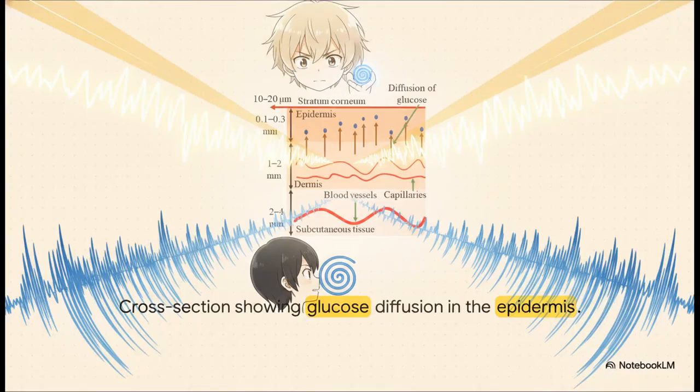This has led to some absolutely incredible medical breakthroughs. Take imaging deep through human skin, for example. In pure optical imaging, light gets severely scattered and degraded by tissue the deeper you go. It gets blurry fast. But photoacoustics is the perfect workaround. We send light in, but we let sound come out. Ultrasound waves scatter way less than light waves do, so by listening to those photoacoustic signals, we can peer deep through the epidermis and dermis to track blood glucose diffusion entirely non-invasively. Literally, no needles required. How cool is that?